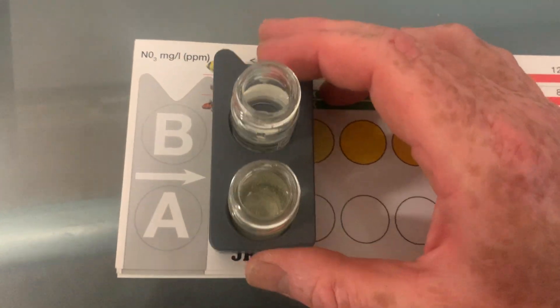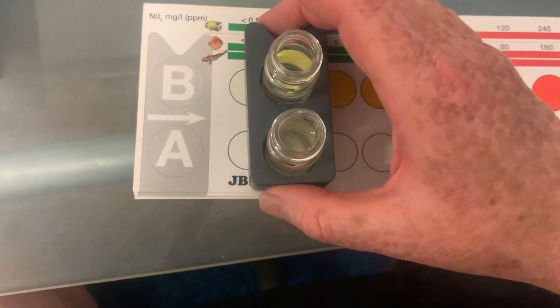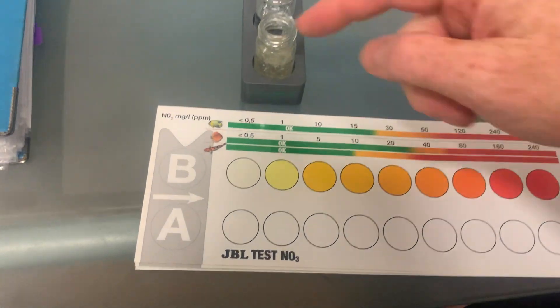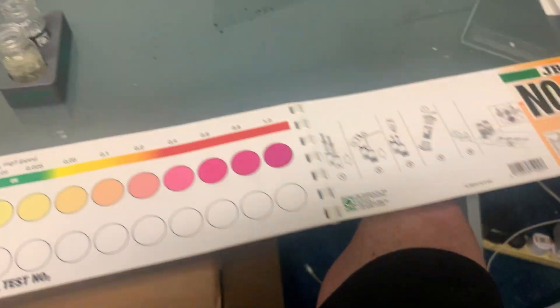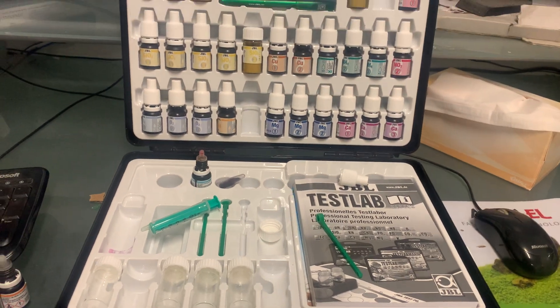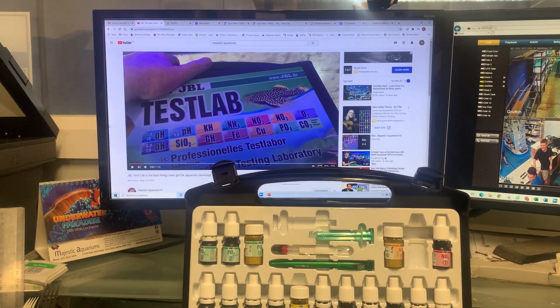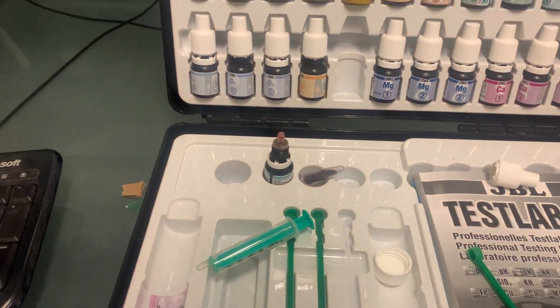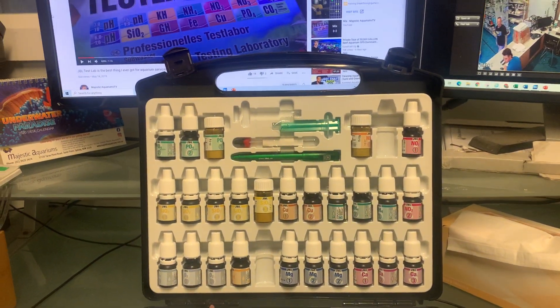Ultimately, this is how you do the test: set up the control, put it on the colour chart, look down at it, and see what colour it matches after 10 minutes. The key to an accurate test is to make sure you've got clean test tubes and that you follow the instructions to the letter. Make sure your test kits don't get too old — nitrate kits tend to fail positive first, whereas a lot of other tests fail negative. Anyway, that's how to do a JBL nitrate test. There are a lot of other nitrate tests on the market and some of them are very dodgy and I do not trust them. Tell us your thoughts.